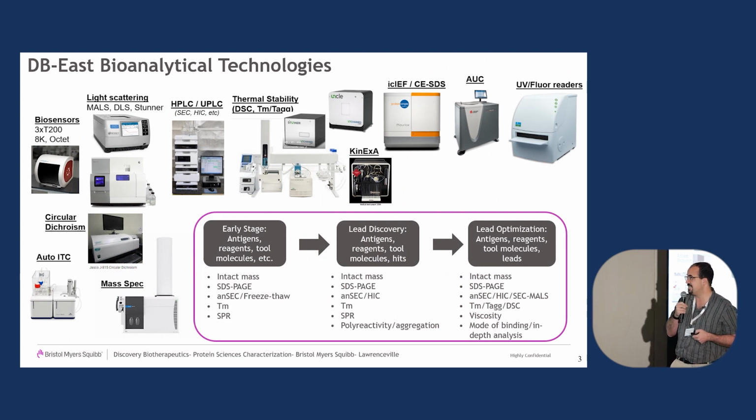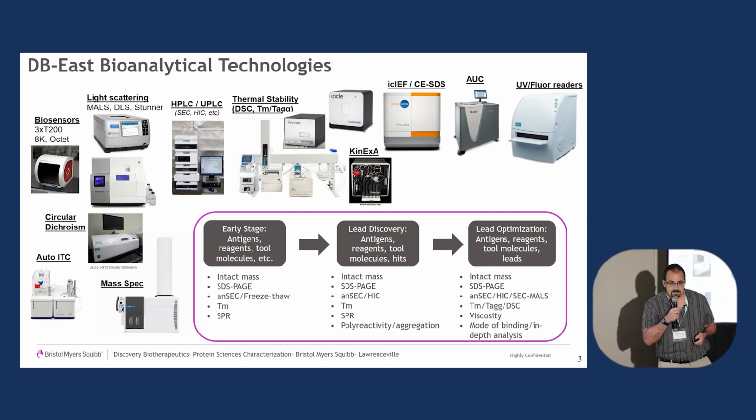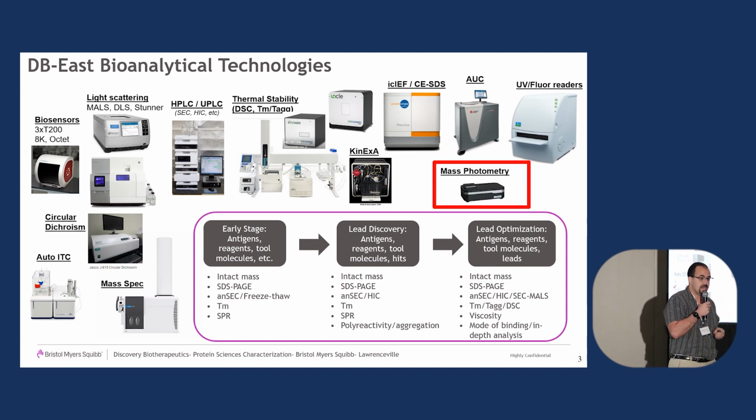I have listed a lot of different techniques and instrumentation here, and what I'm going to talk about a little bit today is how we're utilizing the mass photometry within this huge span of instrumentation and how that's fitting into our platform.